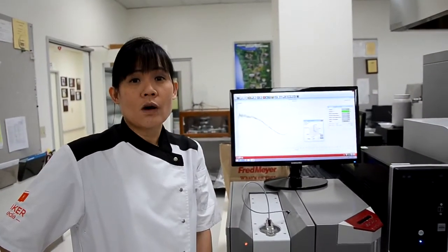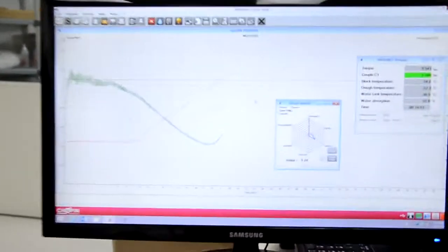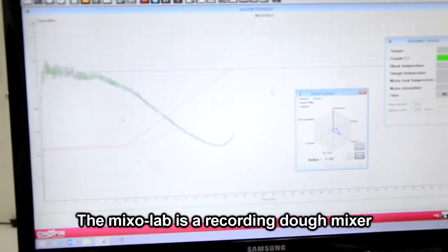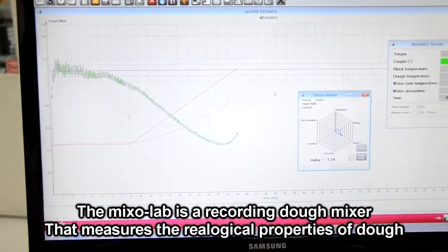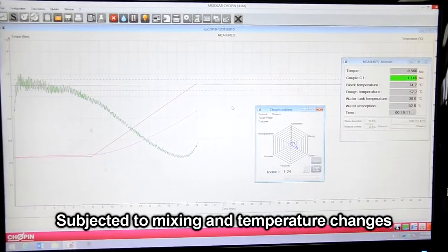Welcome to this off-the-hook video on the Mix-O-Lab. What's a Mix-O-Lab? The Mix-O-Lab is a recording dough mixer that measures the rheological properties of dough subjected to mixing and temperature changes.